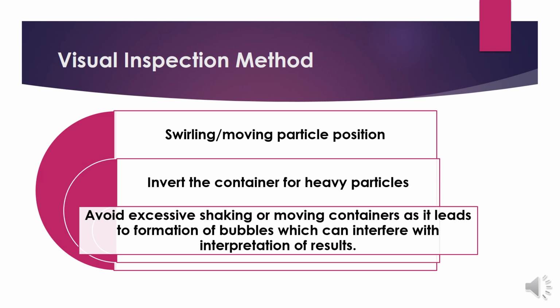It means if you are excessively shaking, moving or swirling your containers to move your particles, there are chances that this causes bubbles to form in the container, which may give you misleading results, suggesting larger particles are available when they are nothing but bubbles which disappear when the movement is withdrawn.